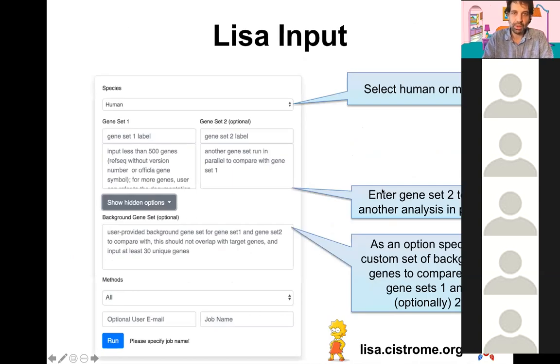When you use LISA, it's also simple to use. One tricky thing, which I hope people appreciate, is that you have the option of putting in two gene sets. Gene set 1 is, for example, the upregulated genes, and gene set 2 you could put in as an option as the downregulated genes. The idea is not that it's going to compare gene set 1 with gene set 2, but that you just do the analysis of these two gene sets at the same time, and then you have some extra features which allow you to compare the analysis. The one is not the control of the other.